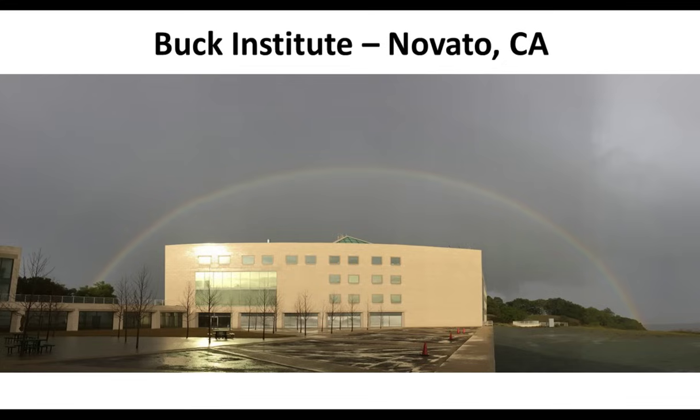And when we do these enrichments, the space and the matrix is so much cleaner because you have 60 to 80% of these PTM-enriched peptides now available. So the quantification that we do afterwards in Skyline from the DIA acquisitions is so clean and has so little interferences. That is really important to us because the quantification of different conditions really brings in biological interest.